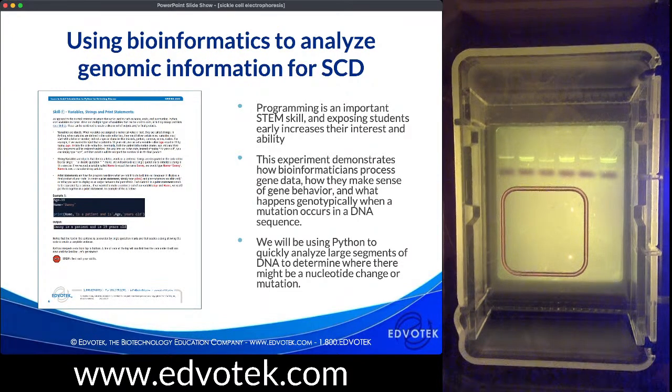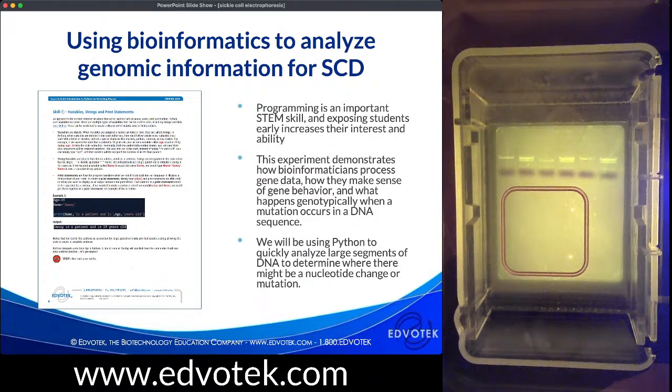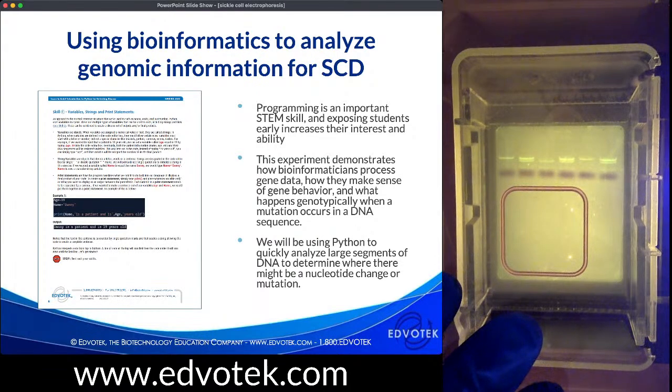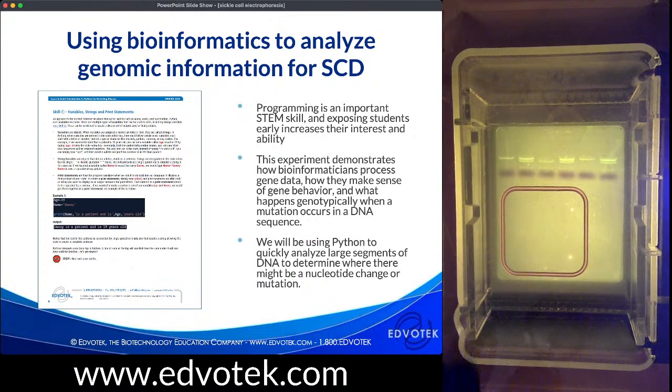And one place where you don't get a bottleneck is in terms of loading, and you also don't get a bottleneck in terms of visualization because each unit has its own visualization system. As with any lab equipment, you need to evaluate the needs of your classroom. The M36 and the power supply are amazing, and if that's what works best in your classroom, that's an option. But maybe you're working in an outreach situation where you send one of these units to a classroom for a demonstration, and you're not sending a separate power supply and a separate electrophoresis chamber and a separate visualization system. So it really is just based on what works for your classroom.